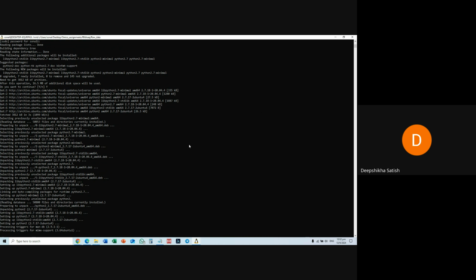If the error is the same, everyone should install this Python version 2. Done? Okay. Wait, Sonali. Everyone did? Yes, ma'am. Sana, Yash, Pushpit, Namrata, Juhi. What about you guys? Yes, ma'am. I was having different errors. Juhi, we will discuss later. First, let them solve this. Okay? We will see your error.